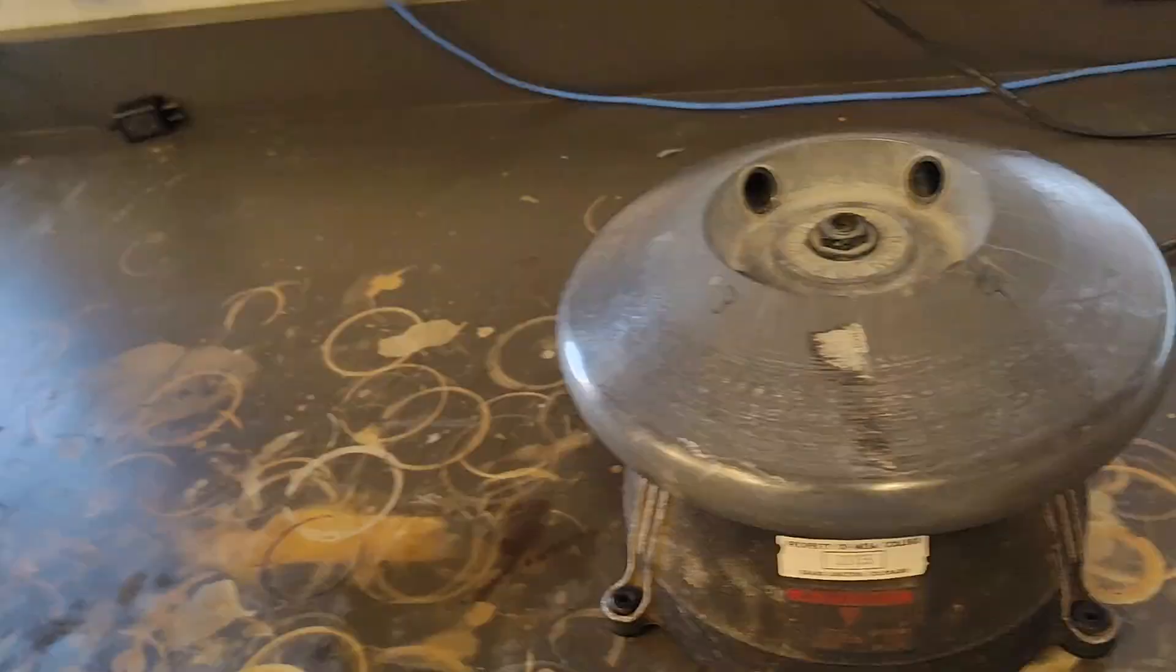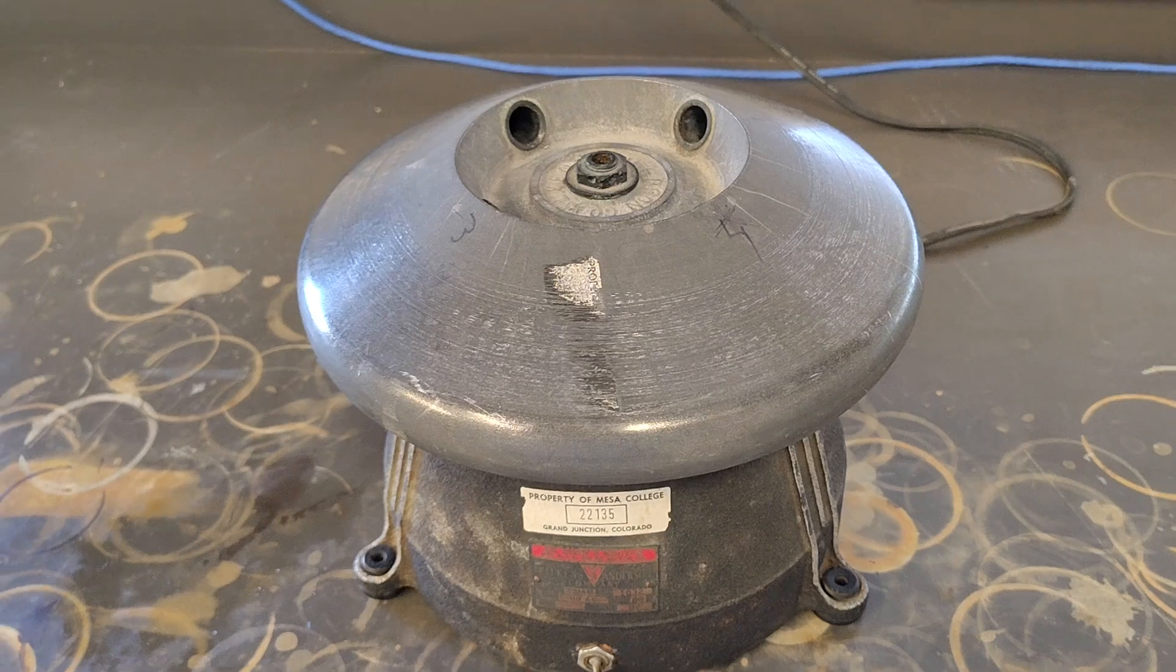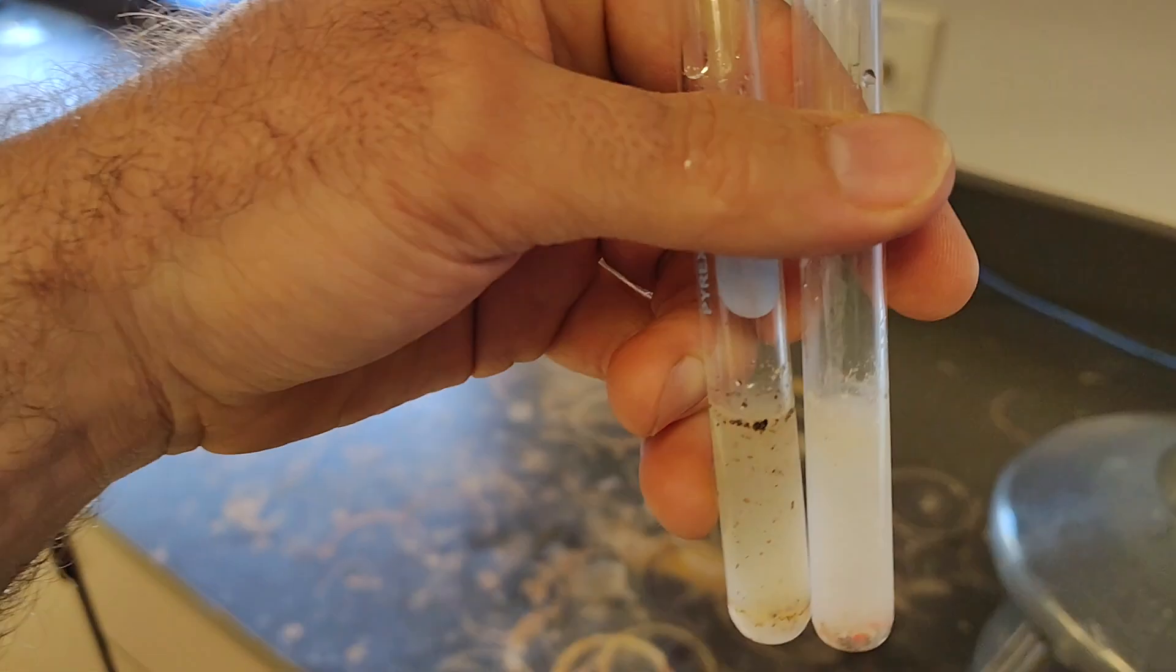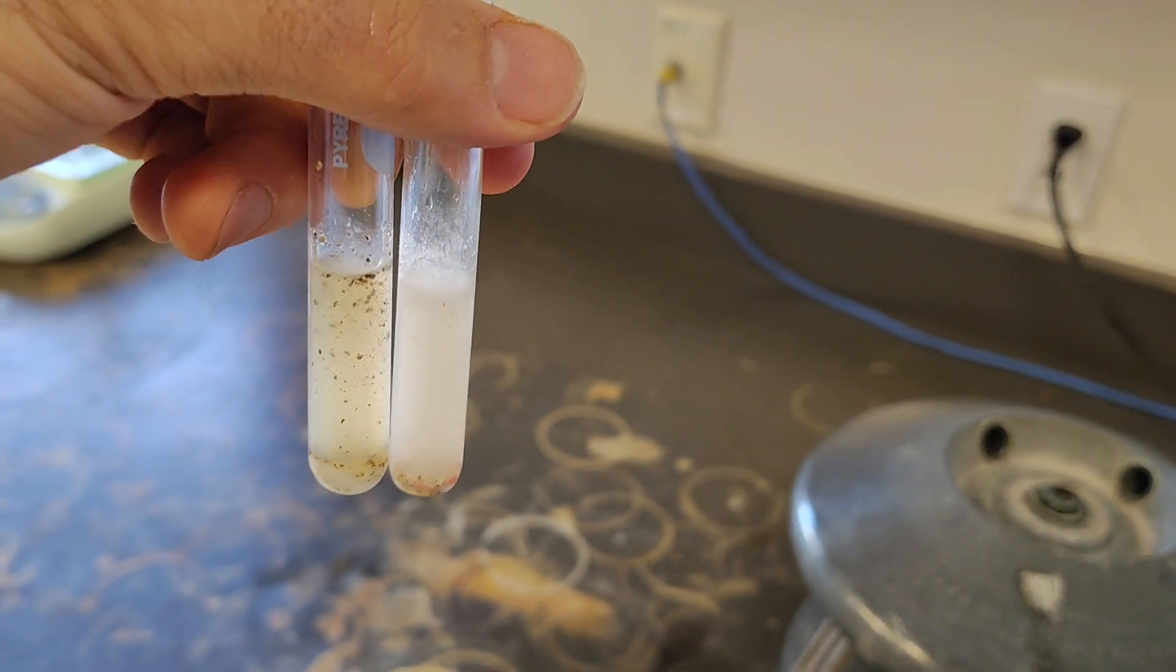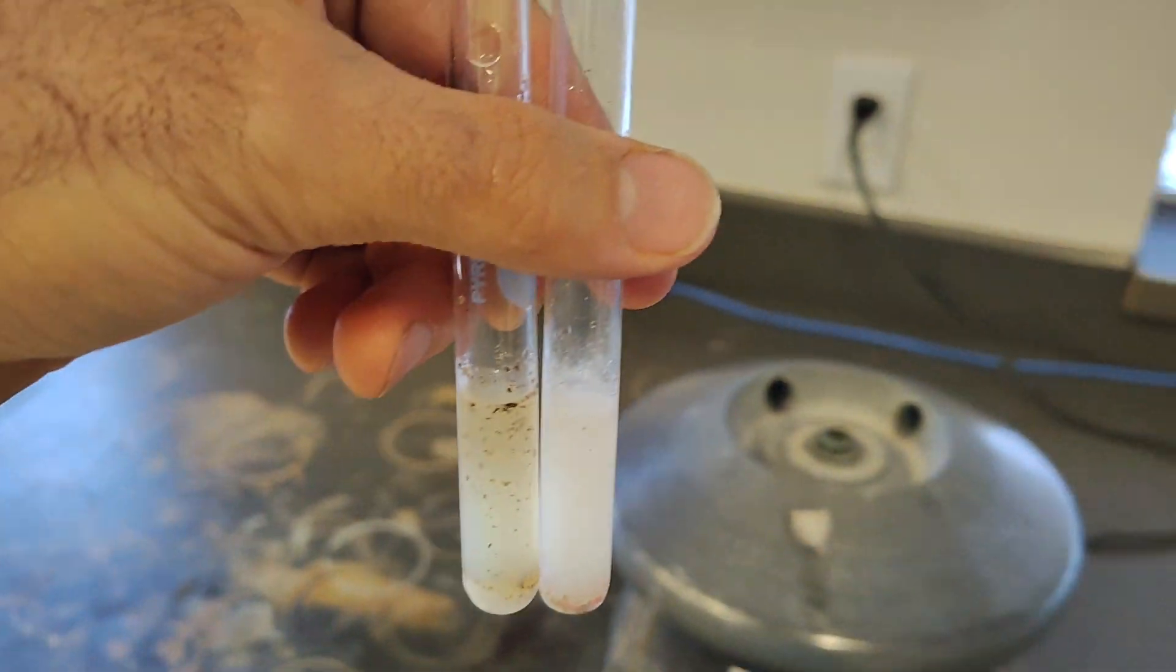Good afternoon class. What I wanted to do today was make a video on this machine right here. This is a centrifuge, and when you have a solution that's kind of murky like this and you want to separate things, you use the centrifuge.